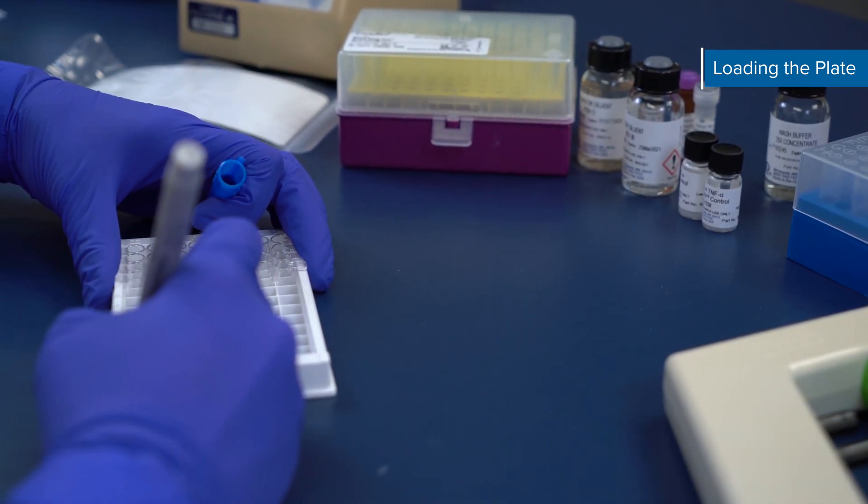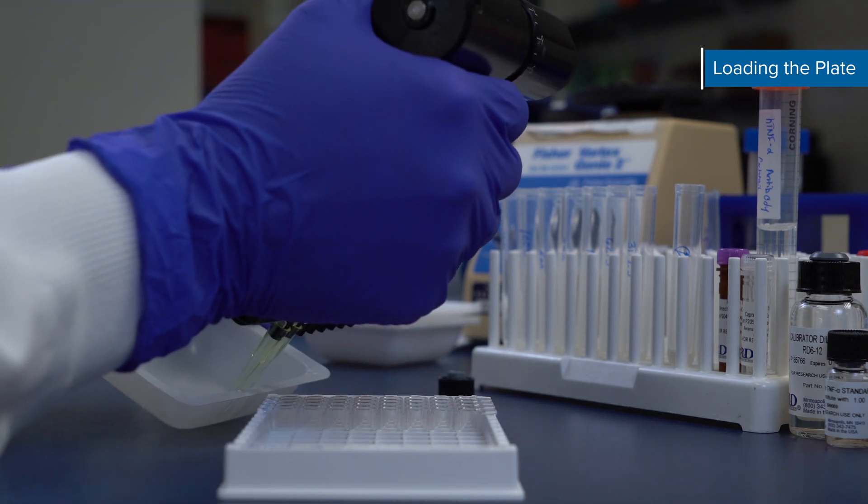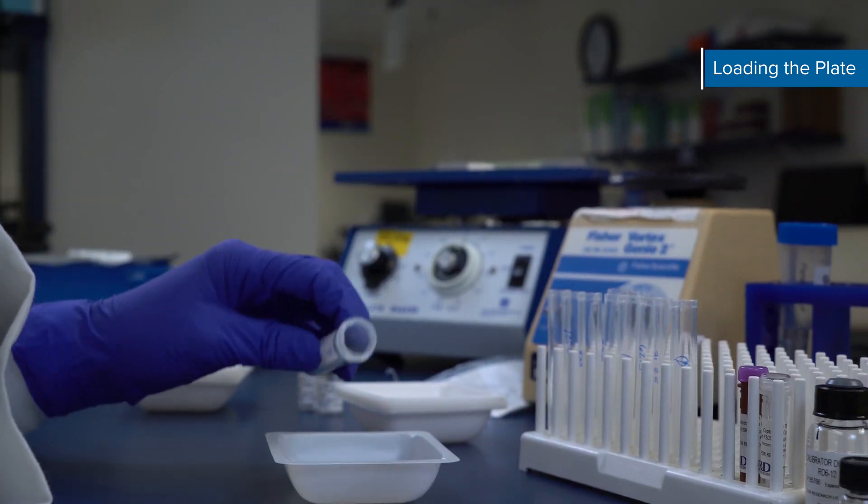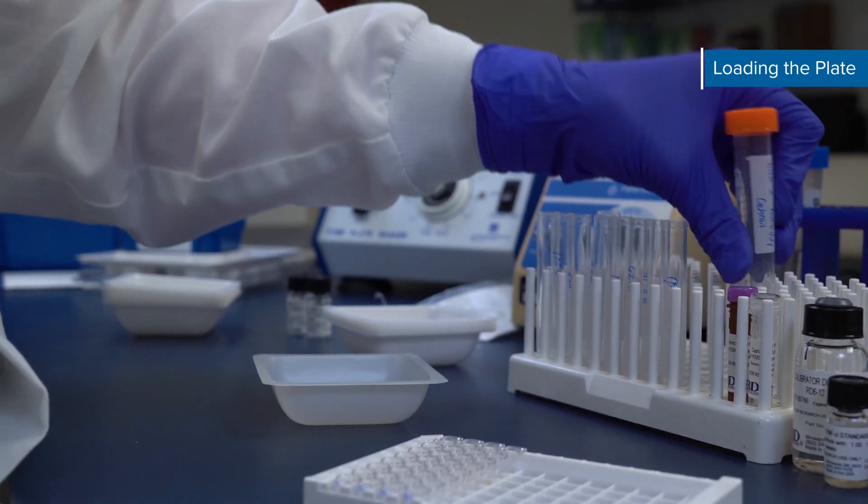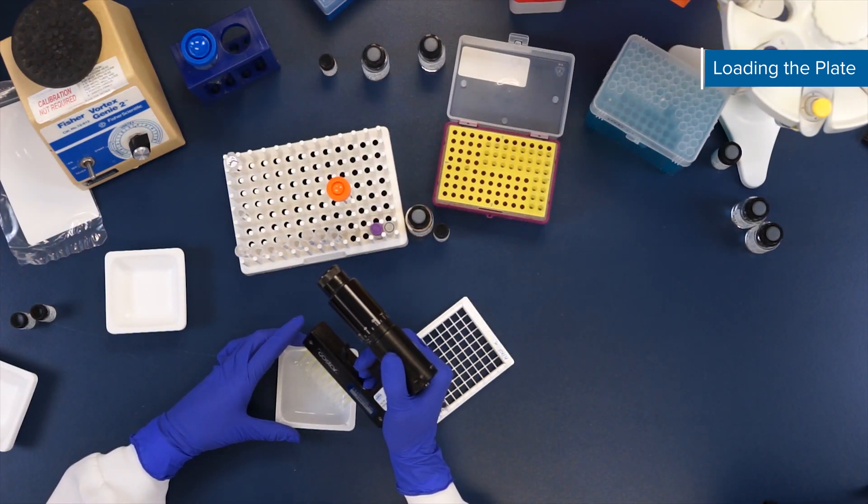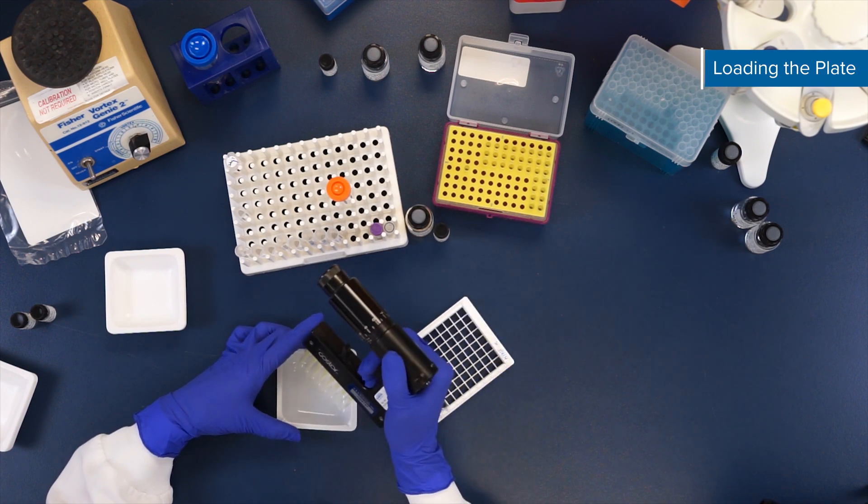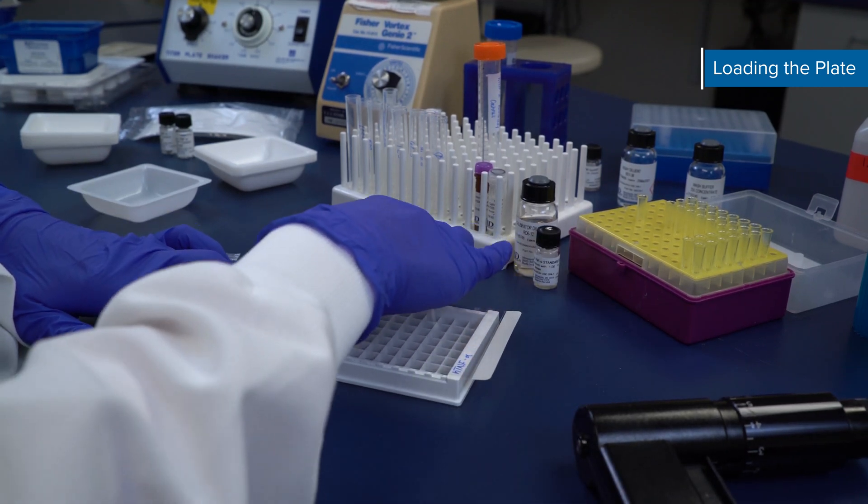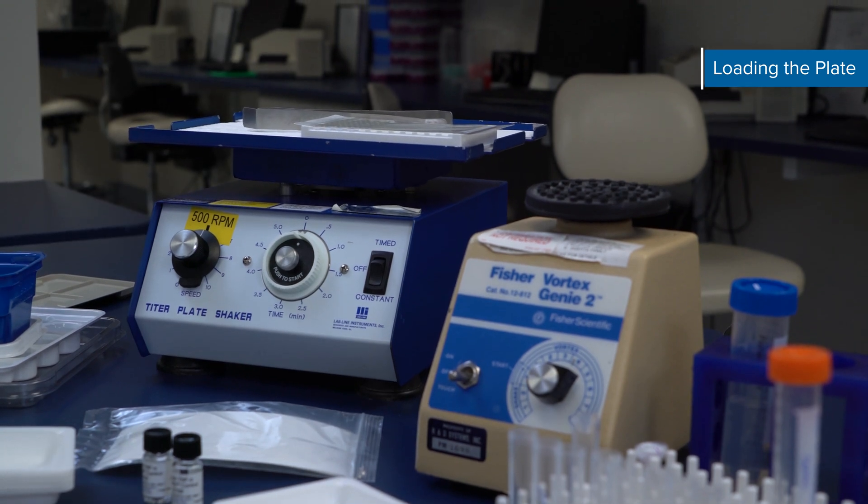First, add 50 µL of standard, control, or sample to each well. Then add 50 µL of the antibody cocktail per well. It's important to follow this order and use consistent pipetting technique. Avoid contact with pipette tips and the solution in the well when adding the antibody cocktail. When all samples and solutions have been added to the plate, cover it with the provided adhesive strip and ensure it is completely sealed. Incubate the plate for one hour at room temperature on the shaker at a 0.12 inch orbit at 500 plus or minus 50 RPM.